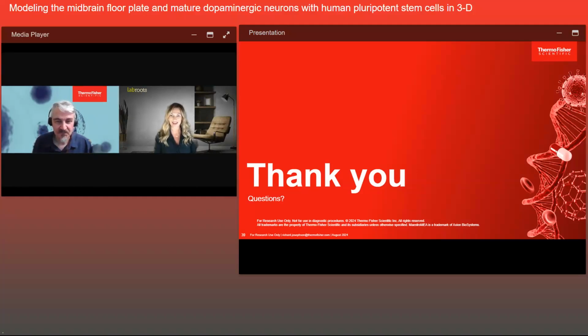Excellent. Thank you for that description. Next question. How do you refresh the medium containing free-floating spheroids without losing them? Very carefully. The way that I have been doing it, particularly for the 96 well plates, is first of all, you don't change all of the medium at once. Every medium change is half of the medium being replaced at a time, or 2/3 of the medium being replaced at a time. You can do that slowly and carefully with a multi-channel pipette.